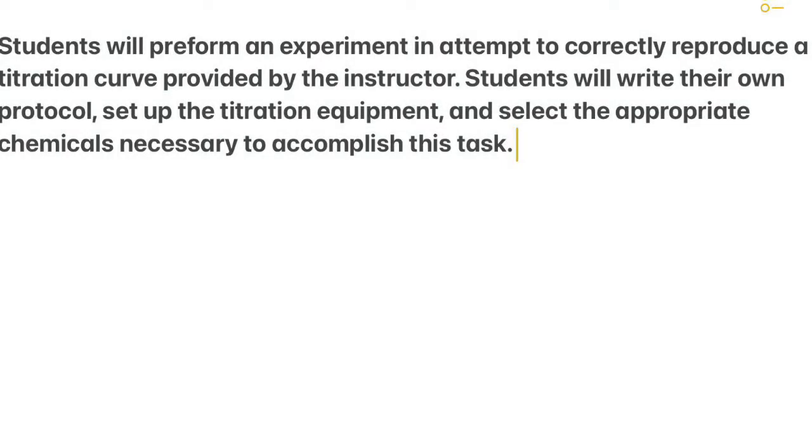Students will perform an experiment and attempt to correctly reproduce a titration curve provided by the instructor. Students will write their own protocol, set up the titration equipment, and select the appropriate chemicals necessary to accomplish this task.